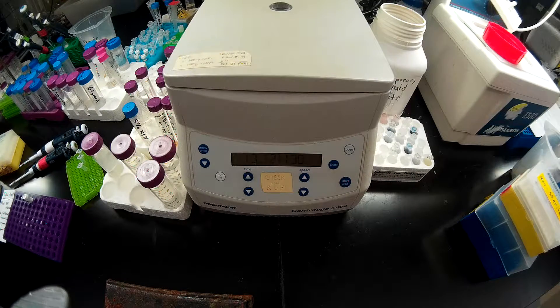Today we're going to learn how to set up a double digest reaction. In the centrifuge in front of me, I have a PCR sample that I have prepped on glass milk. I'm just spinning down the glass milk right now, and it is just about done.